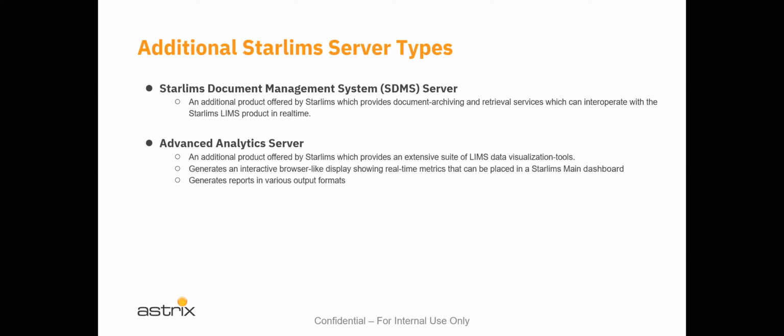And that's provided by the Advanced Analytics system. It has its own server, and there's an entire system of roles management within that system, and there's also a designer specific to that system. We won't be talking about that in too much more detail in this training.